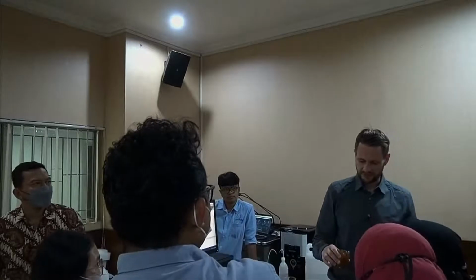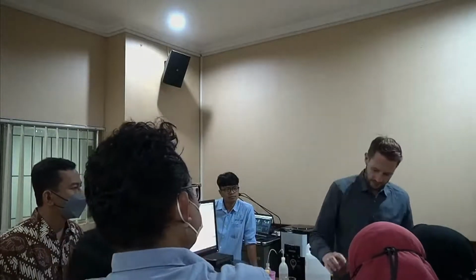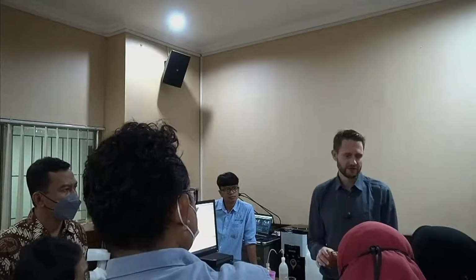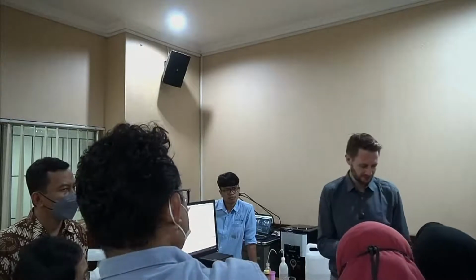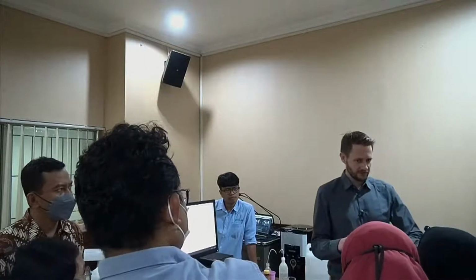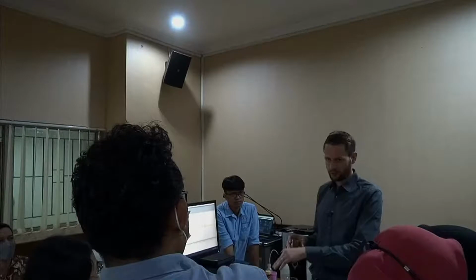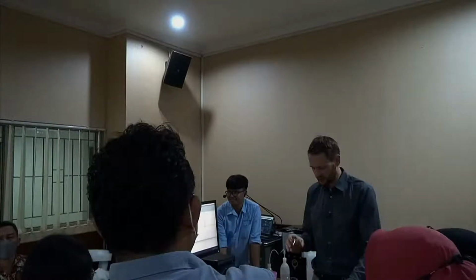It's all sedimented. So usually we would now prepare this, again, external ultrasonic to get the sediments off the ground, because this will not be representative of your entire sample, because some parts are sediment on the ground, the others are still dispersed. Nobody knows if there's a difference in size between the stuff on the bottom and the stuff still dispersed. Is it dispersed in water or in what? Ethanol. Okay, I would actually measure this in alcohol then, better, because if you add the ethanol, it will of course change the liquid itself, which will change the refractive index of the liquid. Let's try. Okay, let's just add it like this.